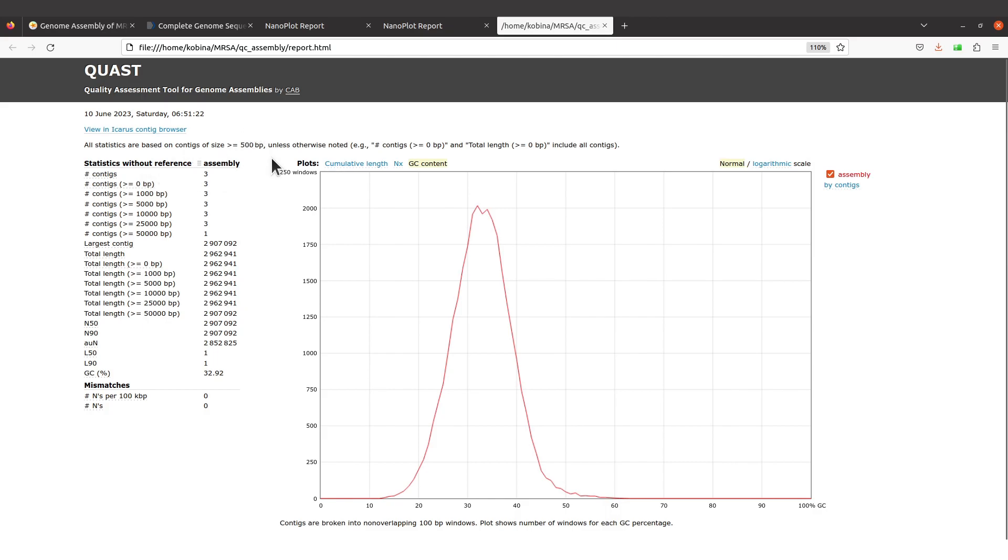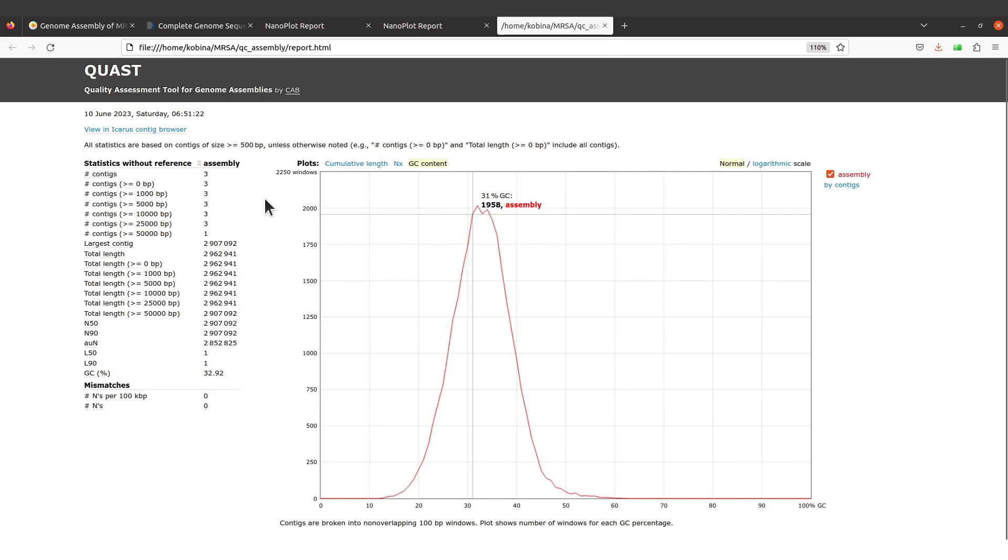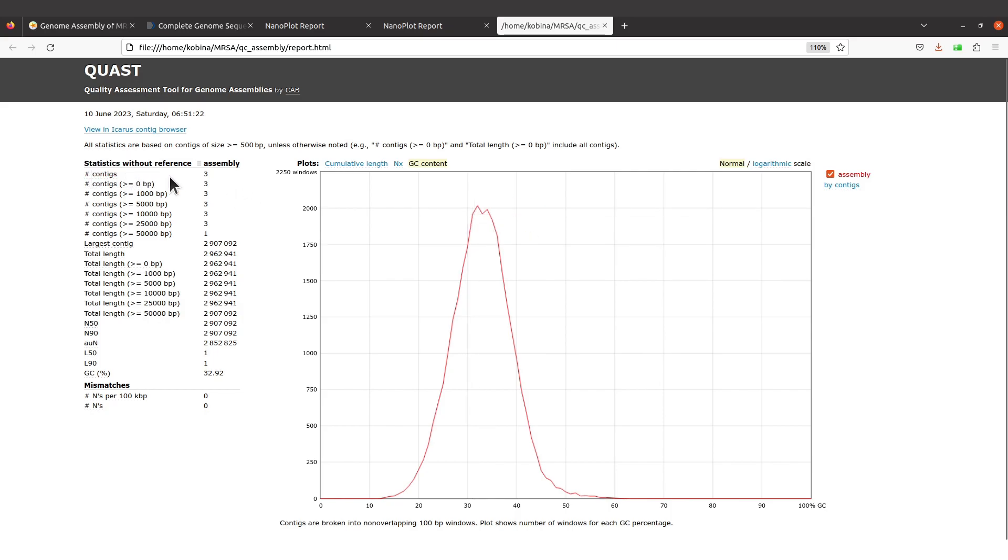...that have their size greater than or equal to 500 bp. That has been indicated here. So sometimes maybe you perform some Linux commands to get your total number of contigs, but then you find that the number you had is different from what you see here.